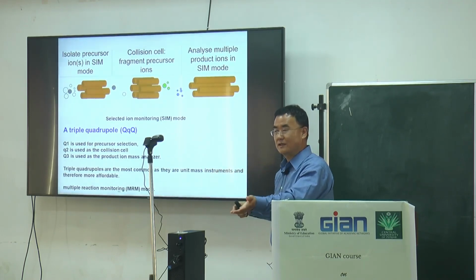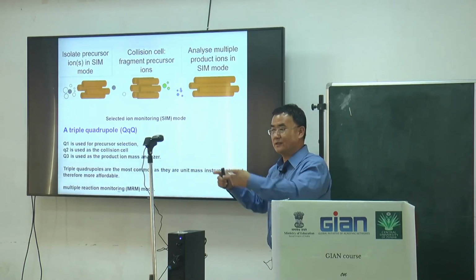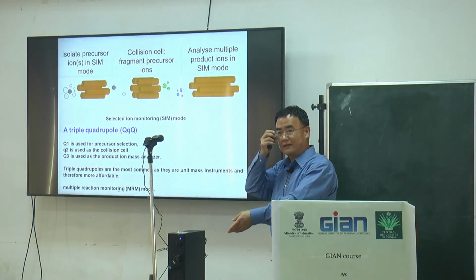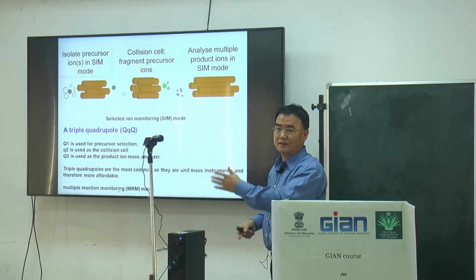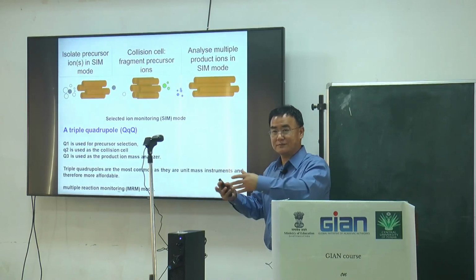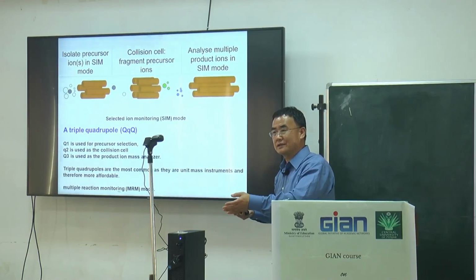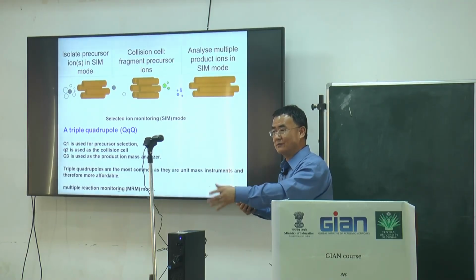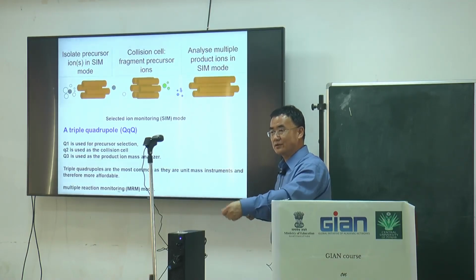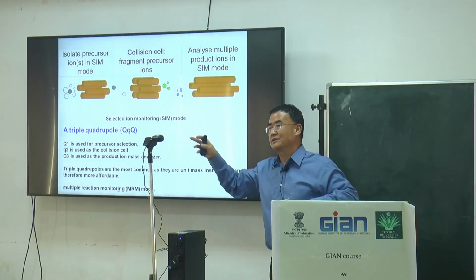For example, precursor. Say your chemical molecule weight is 700. Then you enter 700, and it will show up the mass, the ion peak. But there are many compounds with a molecular weight of 700, so you have to go according to the retention time.